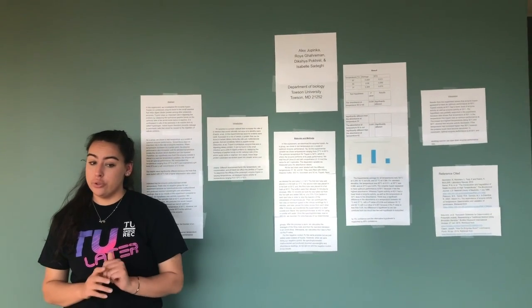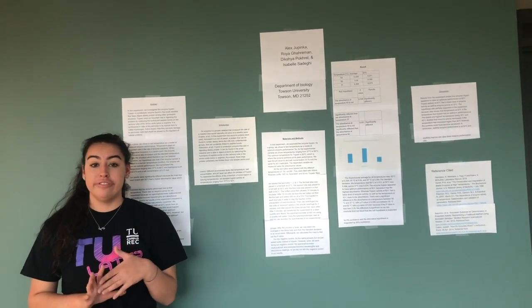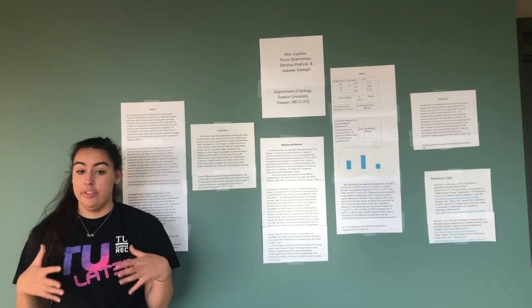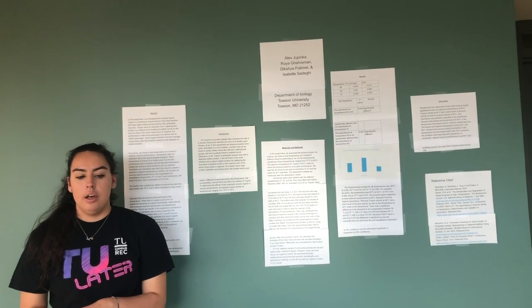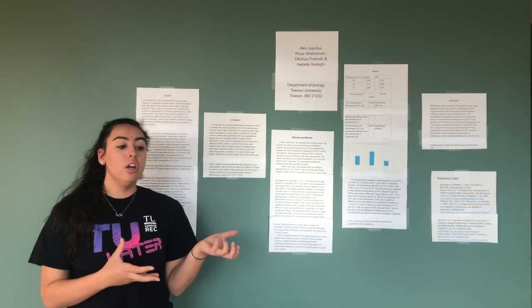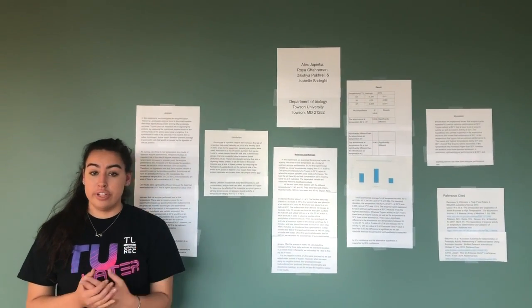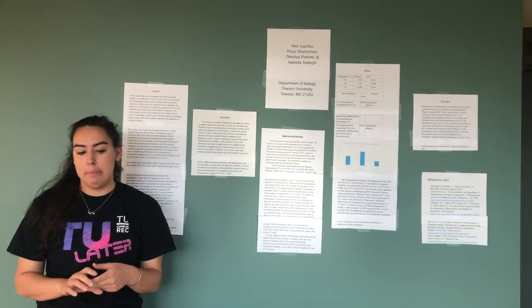So our experiment had two control conditions. The first one was our salt concentration, which we used at 0.15 moles, and our other condition was a pH of 9. And we used this pH because after seeing other groups that did their project on pH, we realized that that was the optimal pH. So the negative controls, we prepared them the same way as our experimental groups, except instead of adding the enzyme trypsin, we added water. In our experiment, we used 3 replicates, and we did this so we could reduce the error, find the outliers, and measure the variability.